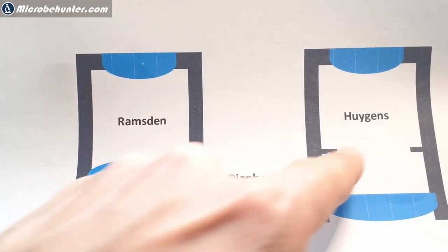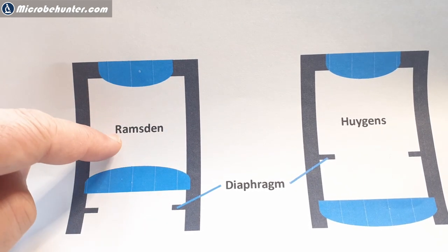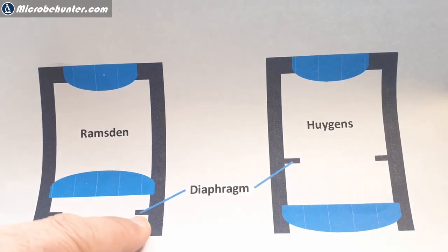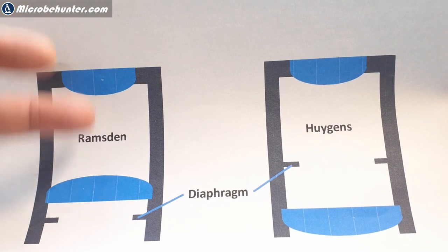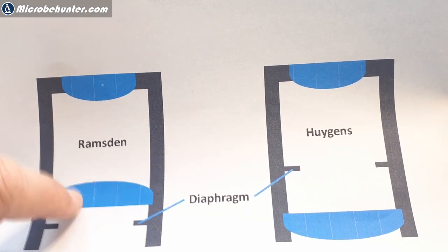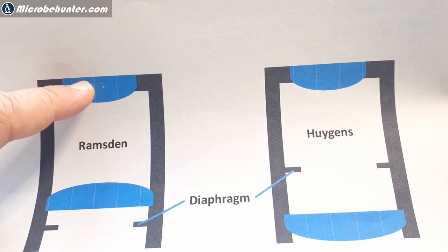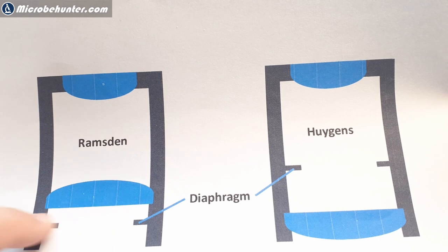This one is called the Ramsden design and this one the Huygens design. In both cases you use plano-convex lenses - flat on one side and curved on the other. In the Ramsden design the curved surfaces point towards each other; in the Huygens design they all point downwards. The second difference is that the diaphragm position differs: in the Huygens design the diaphragm is at the bottom, while in the Ramsden design the diaphragm is between the two lenses. These characteristics - lens orientation and diaphragm position - help you identify which type you have and ensure lenses go back in the correct orientation. Two lenses are used because optical aberrations from one lens are cancelled out by the second. The diaphragm is also where the objective projects the intermediate image.